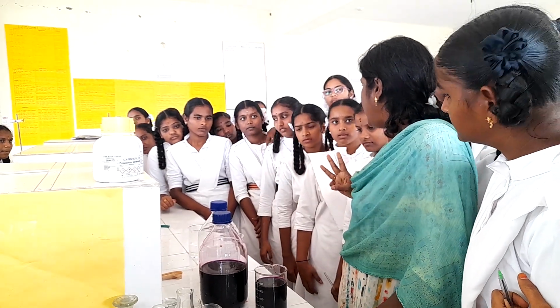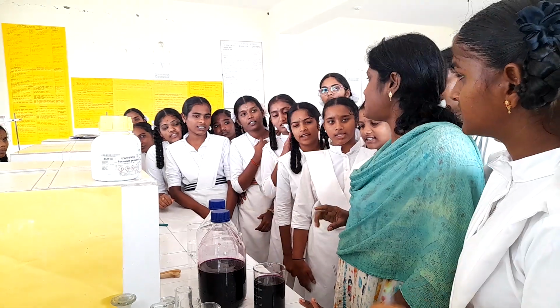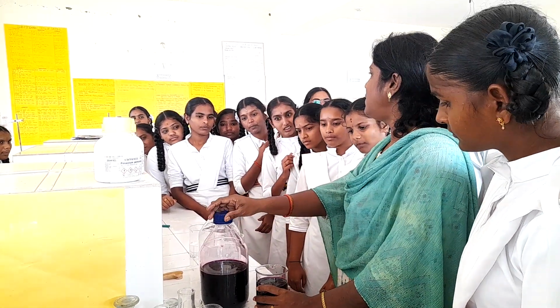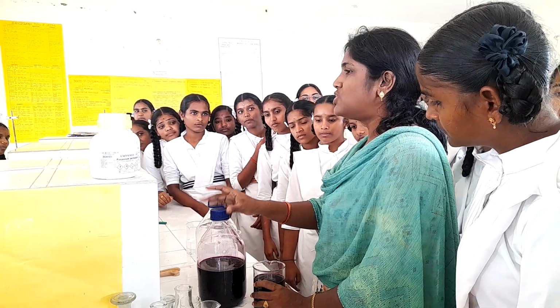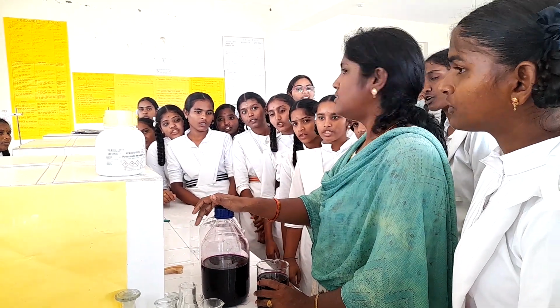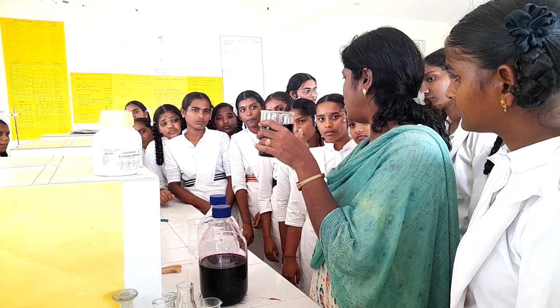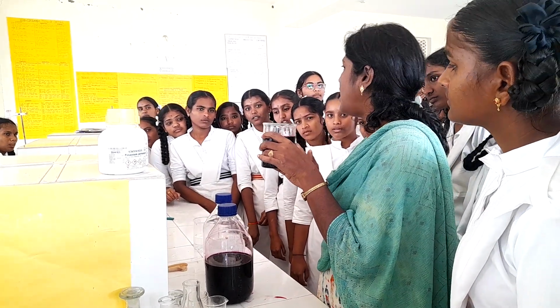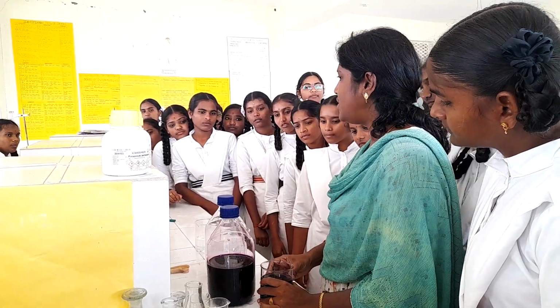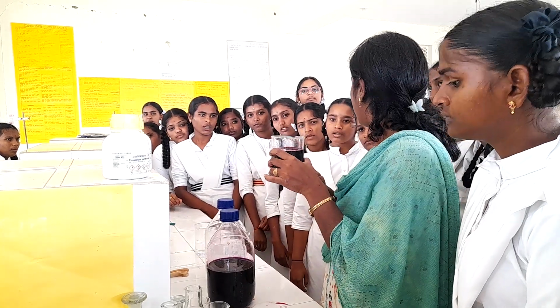Third titration, right? So the titration is between oxalic acid and potassium permanganate. Here I have already prepared the potassium permanganate solution. In your question, what is the molarity given? The potassium permanganate that I am going to provide to you is 0.02 molar concentration. And this one, KMnO4, must be filled in your burette.